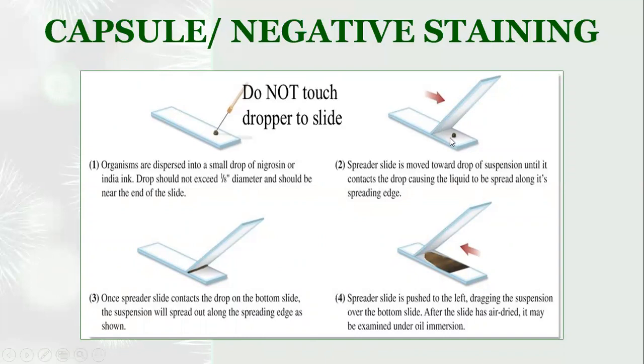Place it near the drop containing bacterial suspension and the dye, then using the second slide, spread the suspension towards the other end, so that the culture is thinned out evenly.